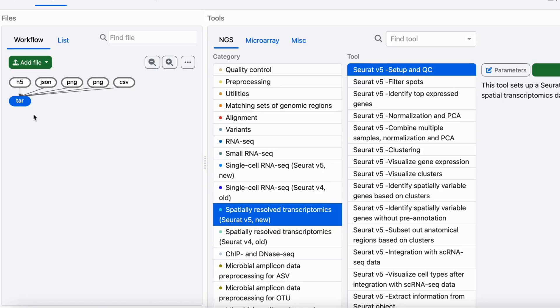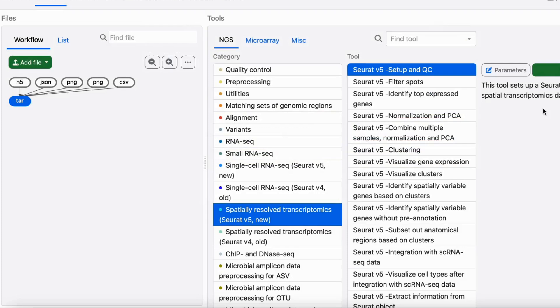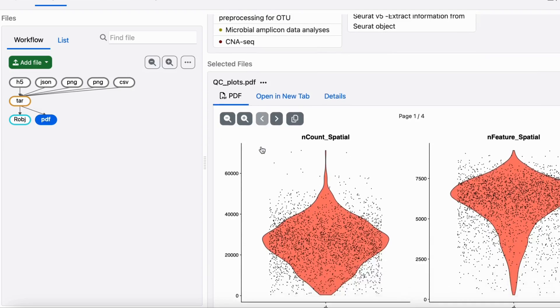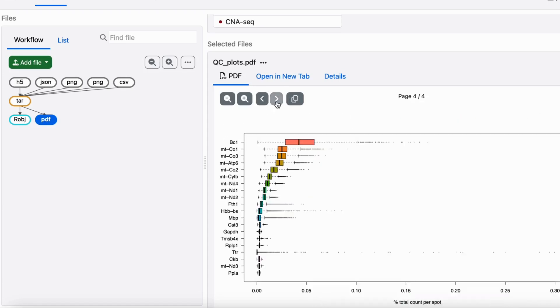Once you have the input files in a tar package, you can use the setup and QC tool to set up the Sura object. Please remember to name your sample before you run this tool. This tool outputs a Sura object that stores the analysis data and can be given as input to the next tool. This tool also outputs quality control plots, which you can use to check the quality of the data. This tool also visualizes the top expressed genes in a box plot.